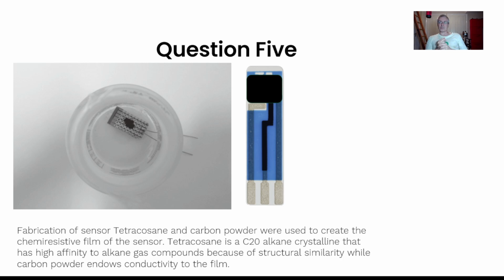You have to get all those PCBs and do all that little soldering, when they could have used the screen printed electrode. Or you could also just drop cast in a similar place and use that electrode and that electrode. Again, I shouldn't have quite crept onto that electrode. So the quick answer is you can replicate that paper. Nobody outside of those authors quite knows what that formulation is. That has to be probably trial and error, or maybe ask the original authors.